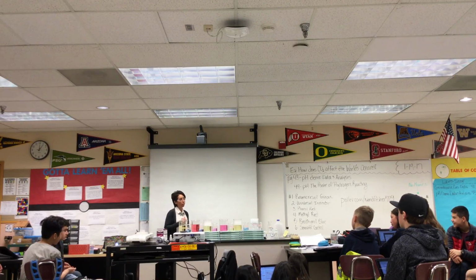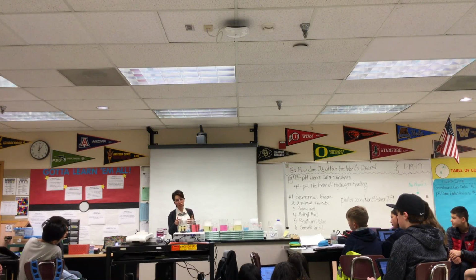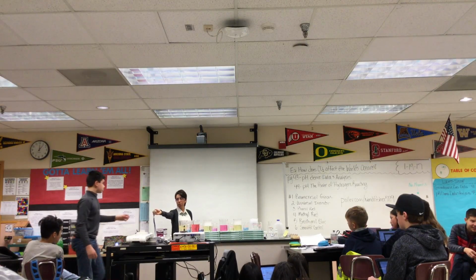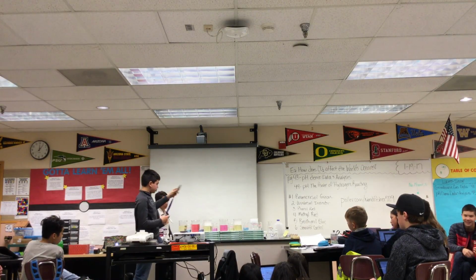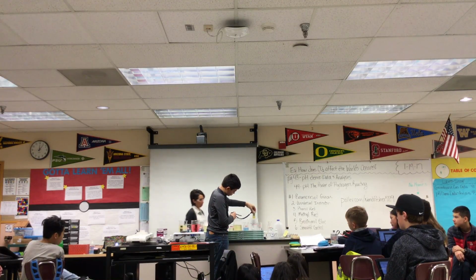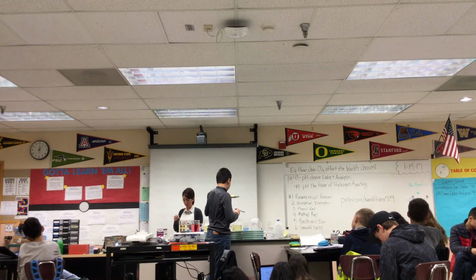You're going to be designing a lab where you're testing the effects on seashells or organisms that have a hard shell that live in the ocean. You'll use different pHs of solutions, dropping in shells and watching the reaction between the solution and the shell. We'll find our final-ish pH of that last one, the seawater. About 5 right now. So that final seawater one is 5.